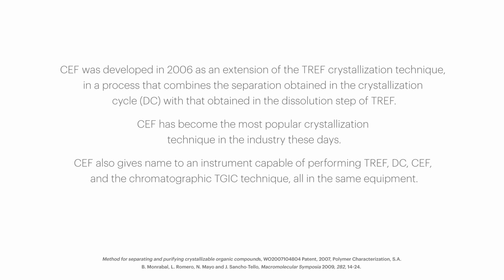CEF has become the most popular crystallization technique in the industry these days. CEF also gives name to an instrument capable of performing TREF, DC, CEF, and the chromatographic TGIC technique, all in the same equipment.